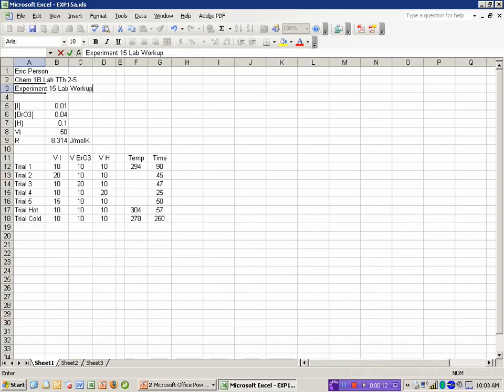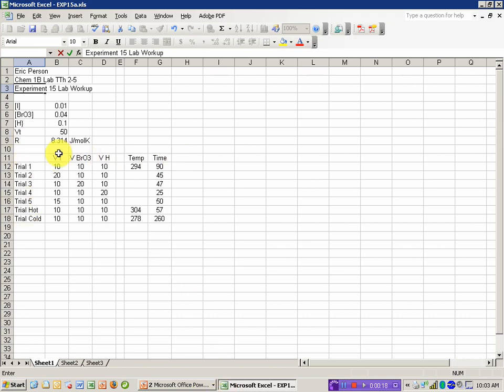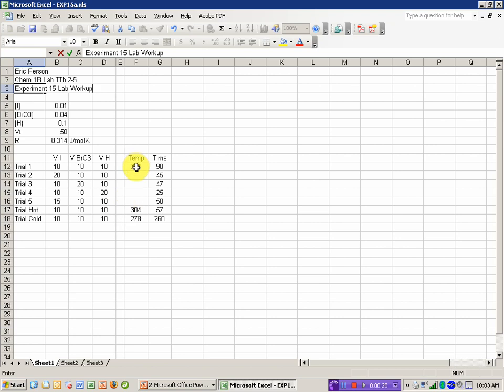What I've done so far is entered in my raw data. You'll notice I've labeled each of the trials, put in headers for the categories of information I've added. I've chosen to enter the volumes and I'll go ahead and calculate the concentrations here in Excel. I've entered the temperature in Kelvin and the time in seconds.